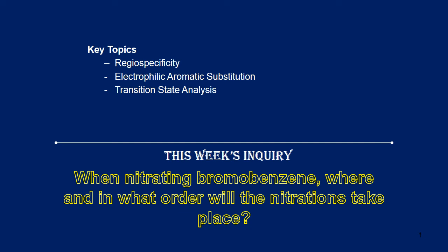Welcome to the Fundamentals lecture for Chem 118, Experiment 3. This time we're going to be talking about a phenomenon known as regiospecificity. And we're going to do that by investigating a reaction known as electrophilic aromatic substitution. And then finally today we're going to talk a little bit about infrared spectroscopy, which will be our final analytical technique, which we'll be using for the rest of the semester to characterize some of the compounds that we create.